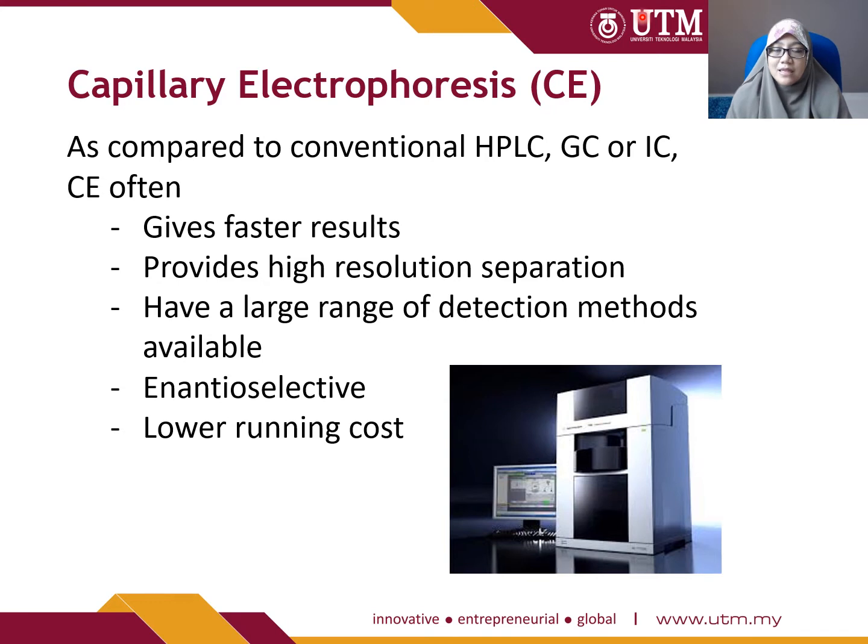And then a large range of detection methods is available. Okay, so detector dia sangat banyak, and analyte yang dia boleh cover ada all the analytes that can be covered using HPLC, GC and IC, but in a very minimum amount. Okay, analytes yang boleh digunakan dengan CE ialah neutral analytes, any anions, cations, large molecules, and as you know, it's especially used in DNA analysis.